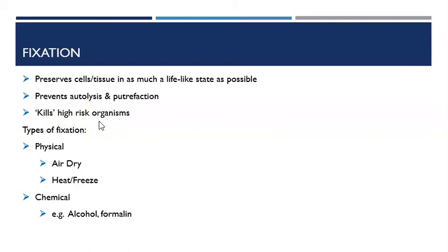And if using things like formalin, we're also cross-linking enzymes together, so basically there will be no enzymatic degradation of that sample. The cellular structures will remain intact, it will not become enzymatically degraded like a fresh sample would, and therefore the samples are stable for prolonged periods of time.